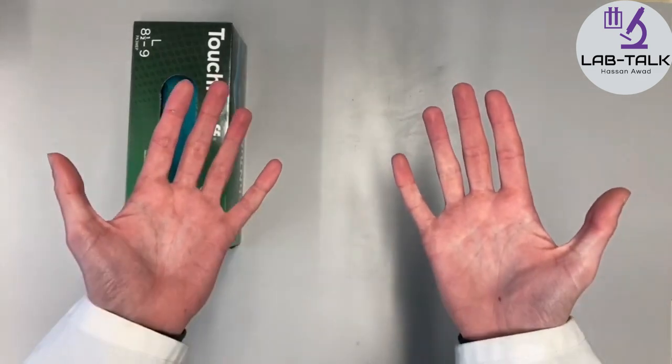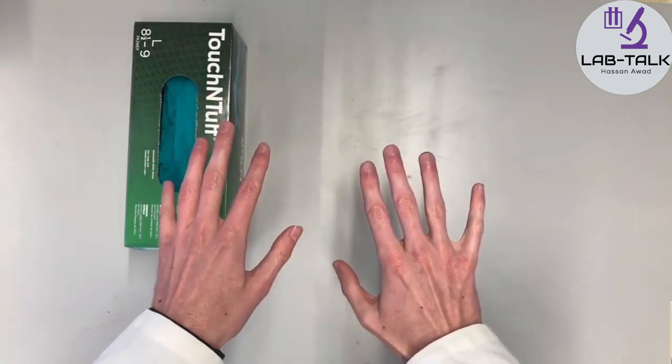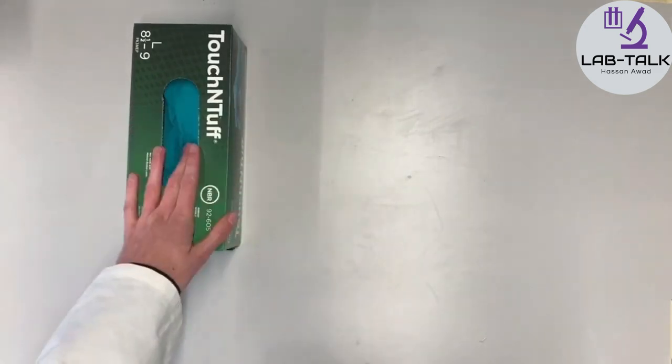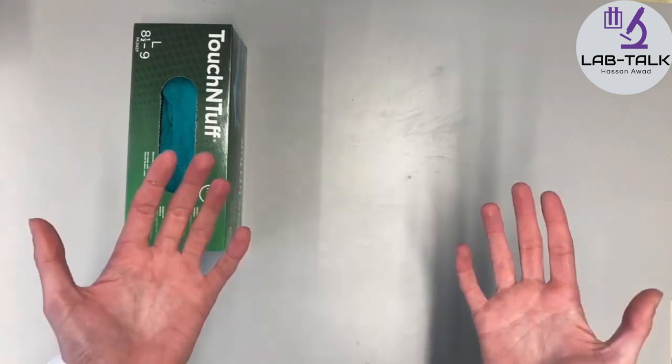These gloves are there to protect your hands. You have two hands — most people at least — and they are very expensive to repair or to replace. These gloves are very cheap to replace. So, we use gloves to protect our hands against any chemicals in the lab.